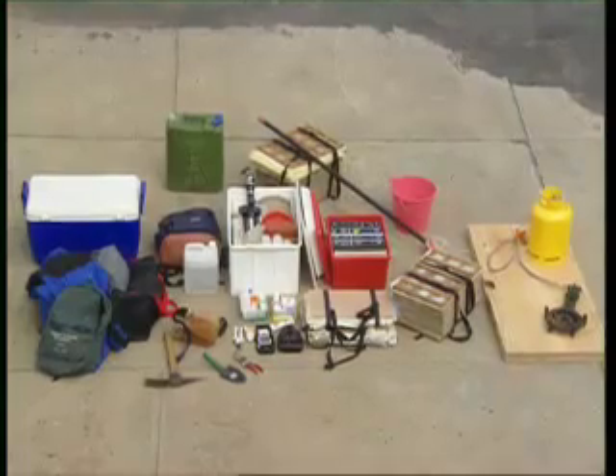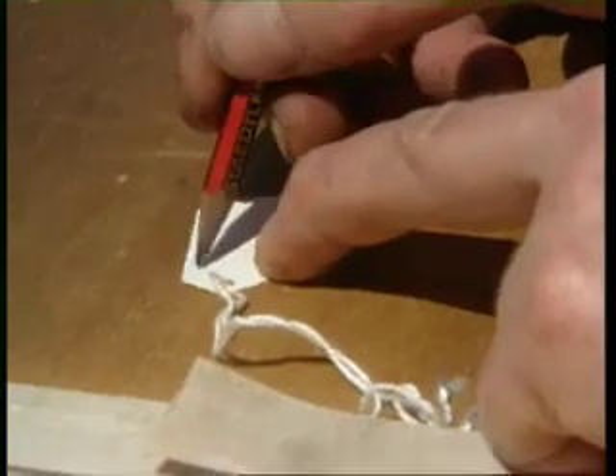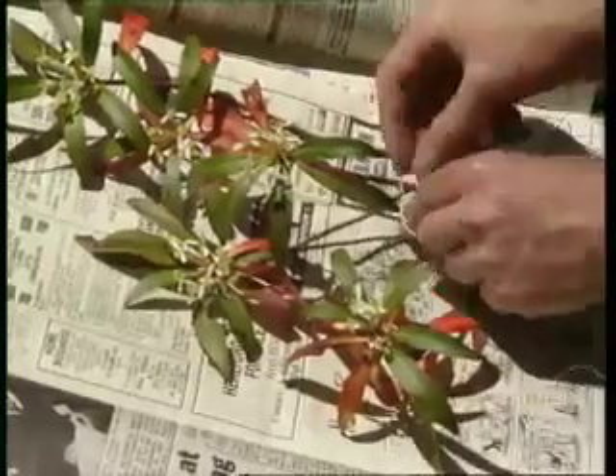The remaining items on the checklist enable us to gather important information about the site and the specimen collected. Jeweller's tags are very useful. As you make a new collection, prepare a tag with your name and collecting number and attach it directly to the specimen.